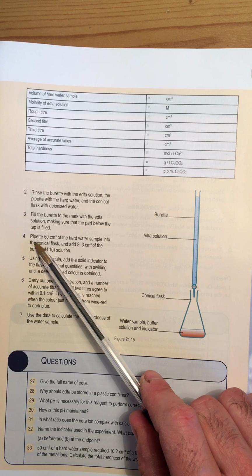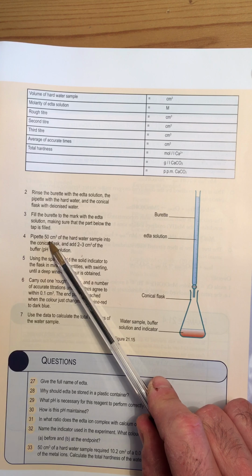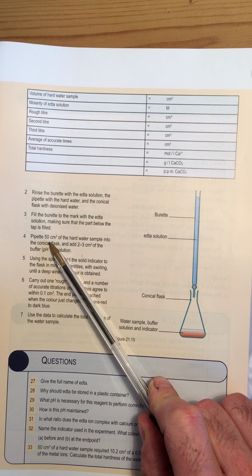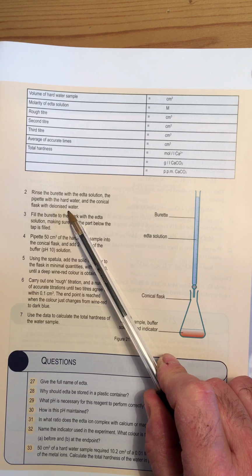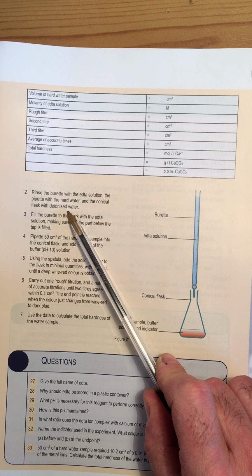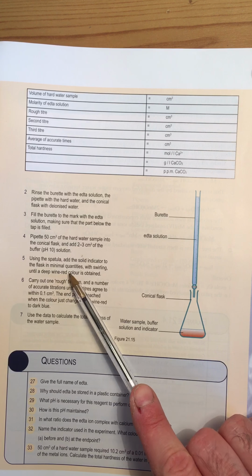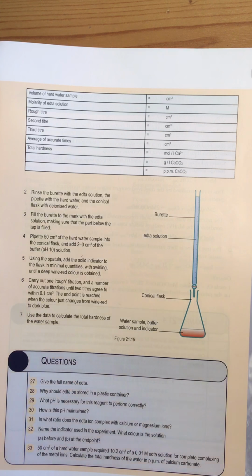Okay, so important things to point out there. In the pipette, you're going to transfer 50 mils of your sample. Also, you should use deionized water, because tap water would contain metal ions that would affect your experiment. And then just remember the color change. It starts at deep wine red and finishes at dark blue.